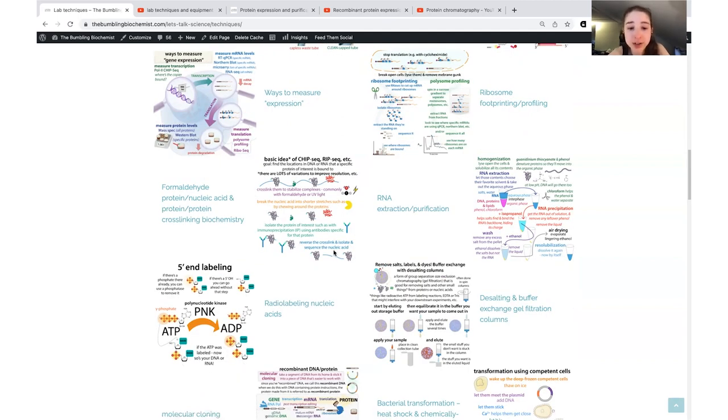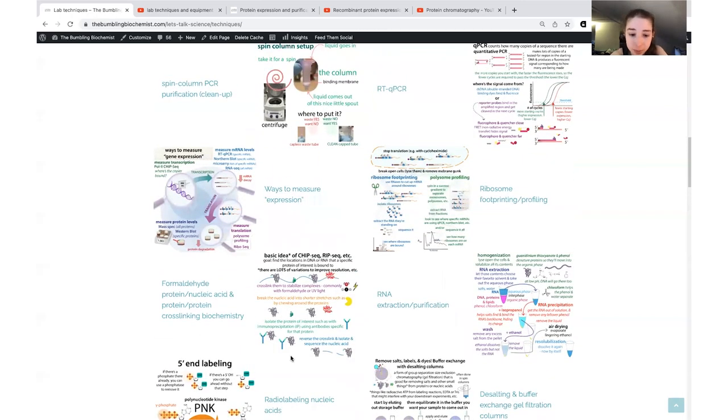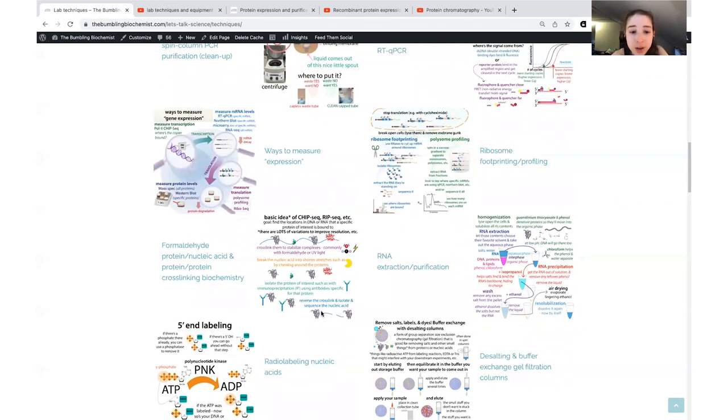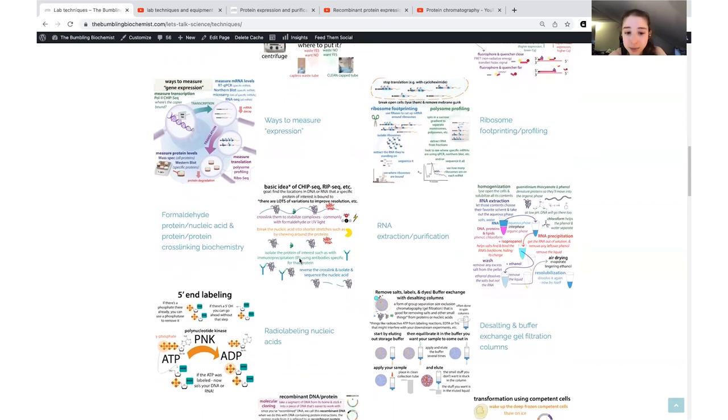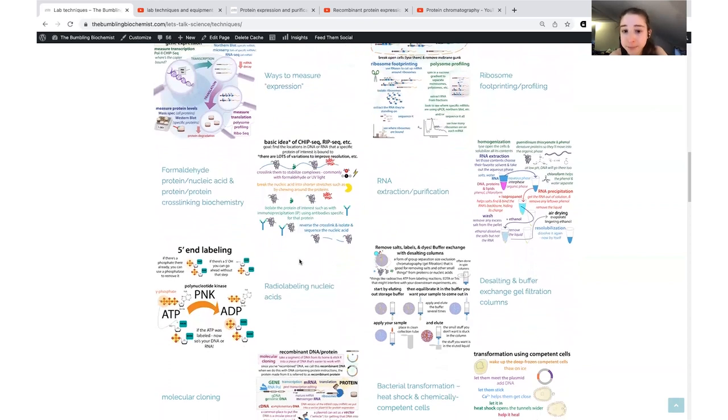While we're on the topic of this, you can also use immunoprecipitation, or IP, pull-downs or co-immunoprecipitation, various things that you might see this called, where you use an antibody against something to see what it is bound to. So you immunoprecipitate it, and then with co-IP, you're looking to see what it was bound to. You can then run a Western or something if you're looking for protein-protein interactions, or you could run a Northern or a Southern if you're looking for what RNA or DNA that protein was bound to. Or you could do PCR. There's a bunch of different methods, but they rely on this ability to immunoprecipitate or use an antibody specific to one thing in order to get information about what it was bound to inside of a cell.